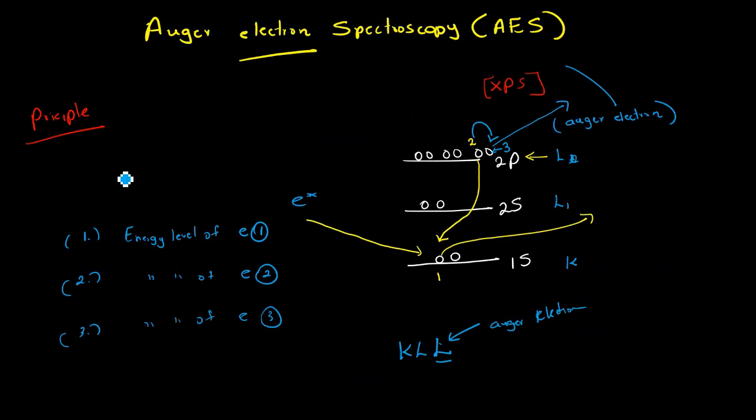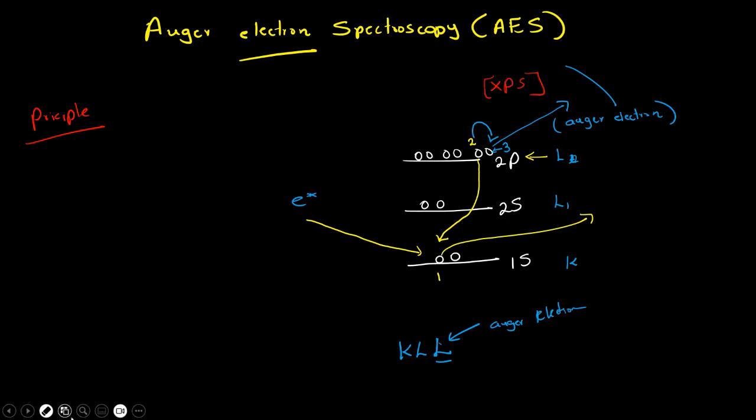If you remember in our XPS, when we put the X-rays on the sample, the X-rays will pop out some electrons.